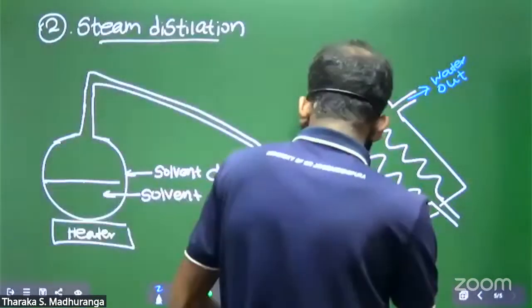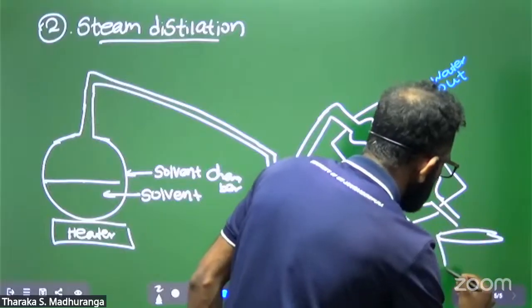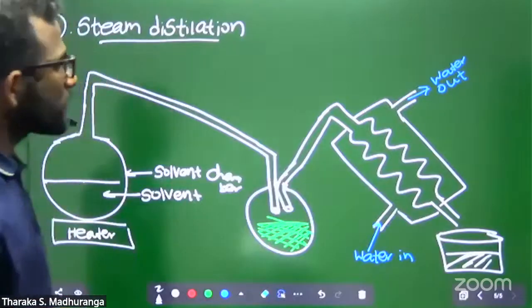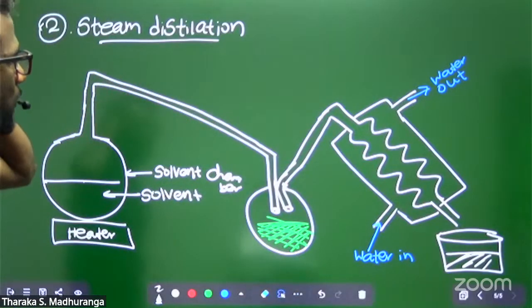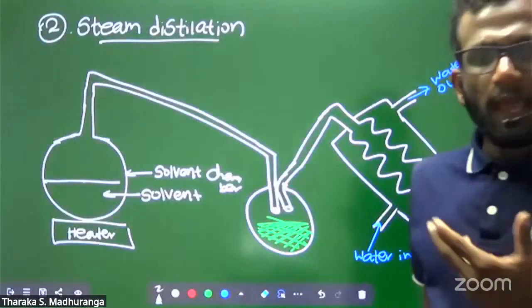And finally, you can separate the crude product from this steam distillation method. Okay, now what happened in this method?